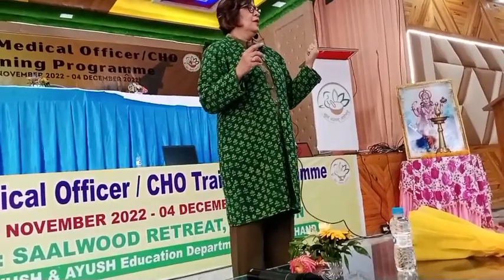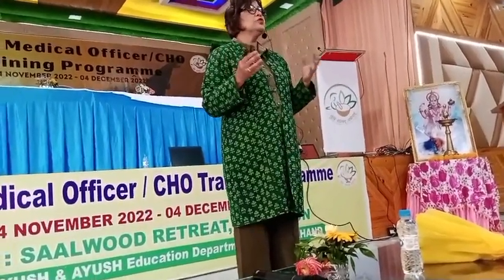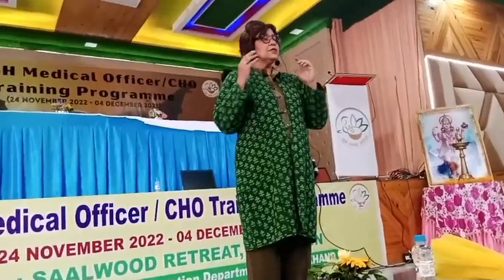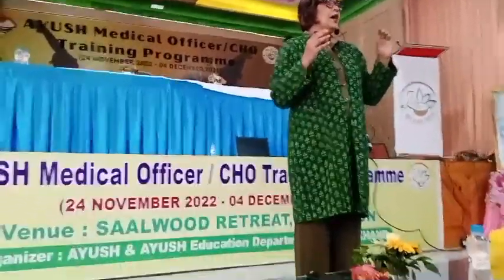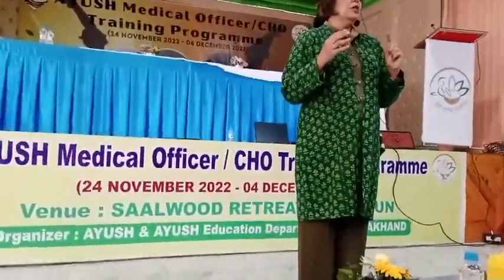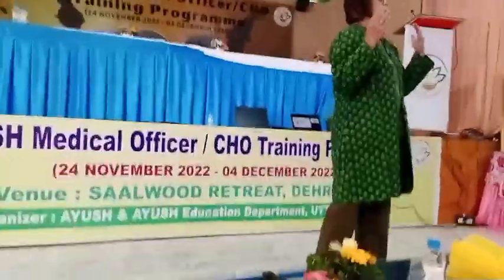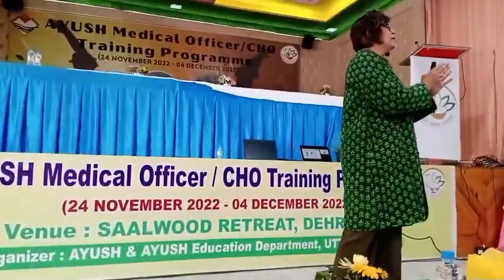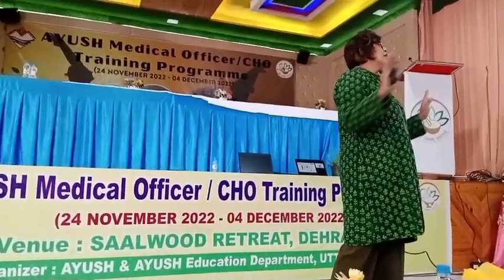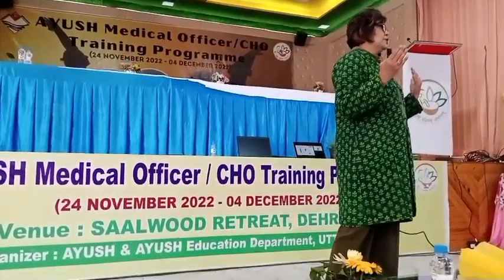So that is why we use a centrifuge. I hope all of you have centrifuges in your place, small centrifuges. A centrifuge is required, and a centrifuge also has a speed and a time, because of the validation studies that have been done. They know that if you put it at 3000 RPM for 15 minutes, your serum will be good and will come out separated. There will be no interference.